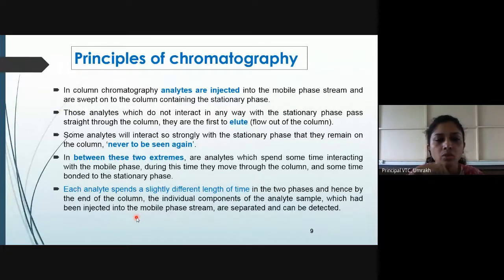Between those two extremities, some analytes are not retained by the stationary phase and reach the detector first, while others interact very strongly with the stationary phase. In between, some analytes spend some time with the stationary phase and then move further with the mobile phase.